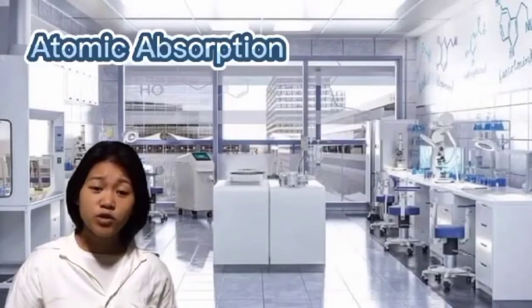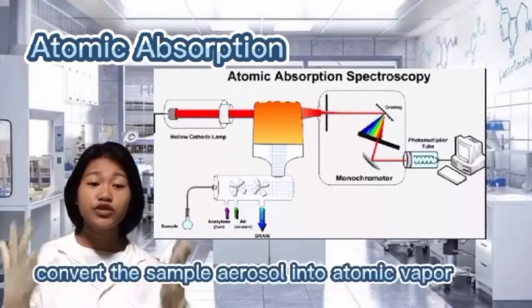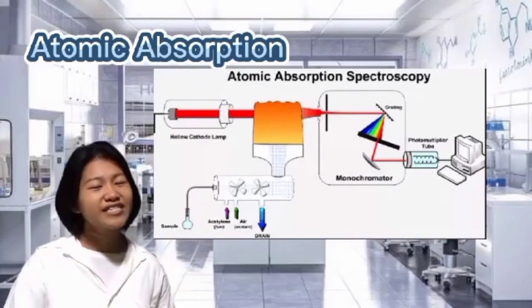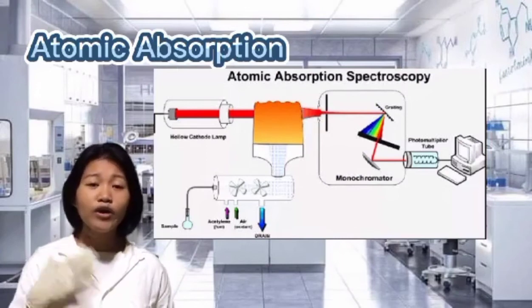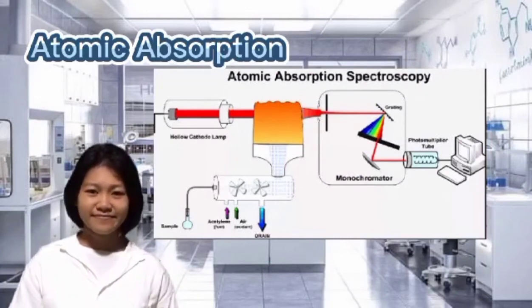In atomic absorption, the only function of the flame is to convert the sample aerosol into atomic vapor, which can then absorb light from the primary light source, either a hollow cathode lamp or an electrodeless discharge lamp.